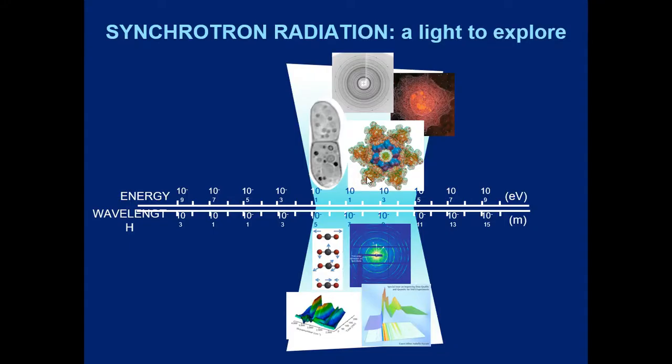Okay, so a little bit about synchrotron radiation. Some of you saw this presentation the other day if you participated in the NSLS data analysis. Some of you were interested in doing that, so I had sent an invite out to those that were interested. But basically what synchrotron radiation is, it's a microscope. A synchrotron is basically a gigantic microscope, and we use light energy to magnify what we're looking at.